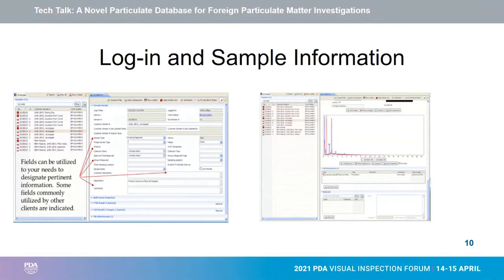So maybe after 1 or 2 or 10 investigations, we can simply go look at reports and things like that. But when we get into looking at 10, 20, 100, 1,000 investigations, having all of this type of information at login, such as vendors and lot numbers, those kinds of things allow us to drill down and help us mine the data and information.